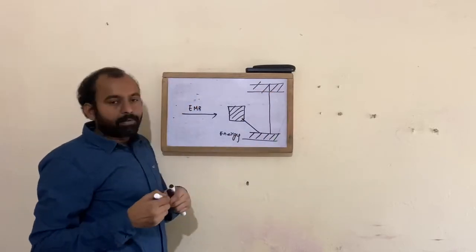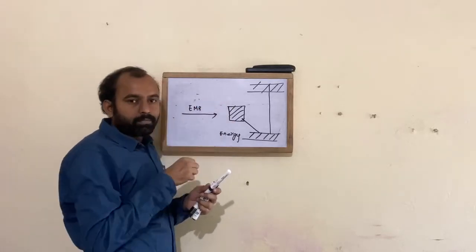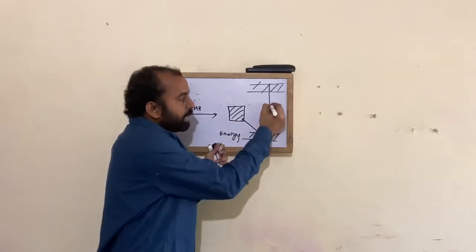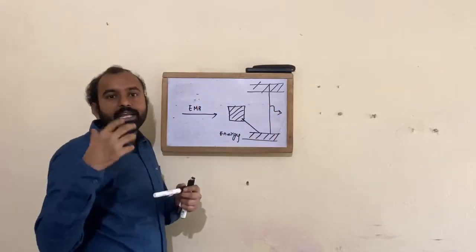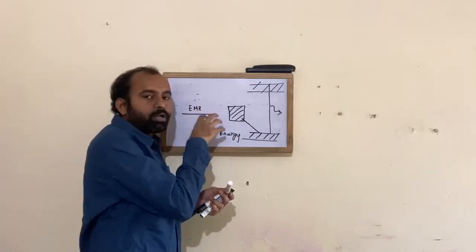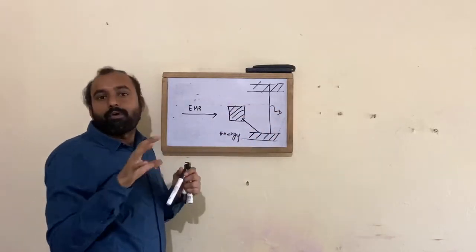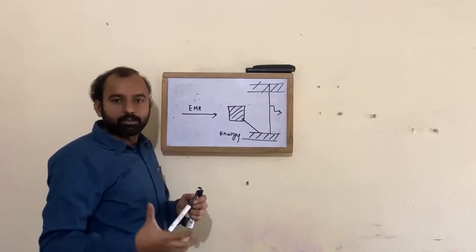This transition may occur by absorption, and after absorption there may be emission of a photon or energy of some wavelength. Sometimes, with the interaction of one photon, you can even get two photons out. This is the fundamental information with which we are going to study fluorescence spectroscopy.